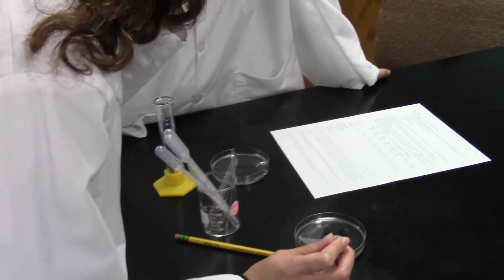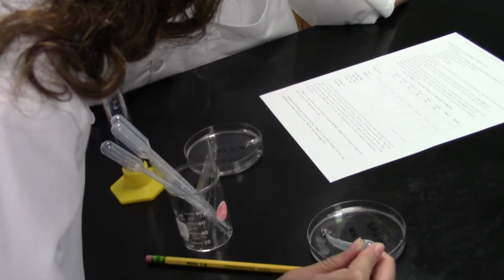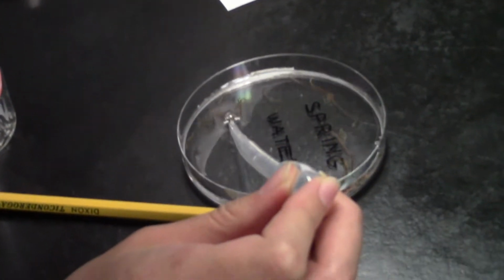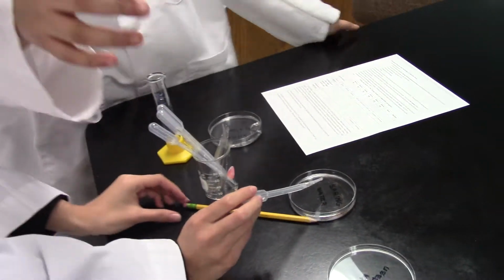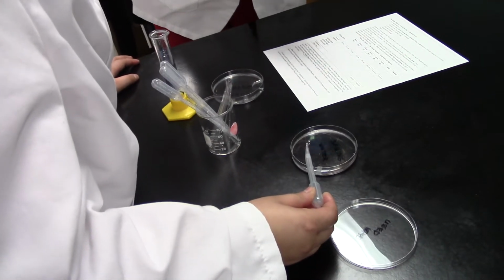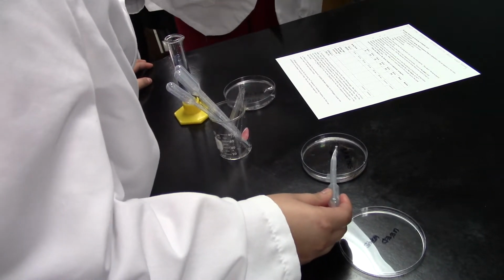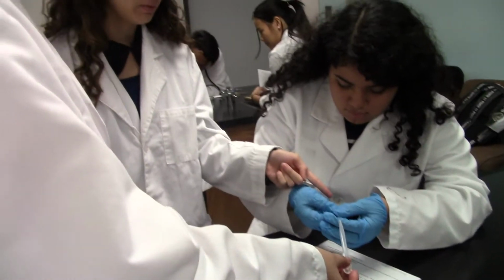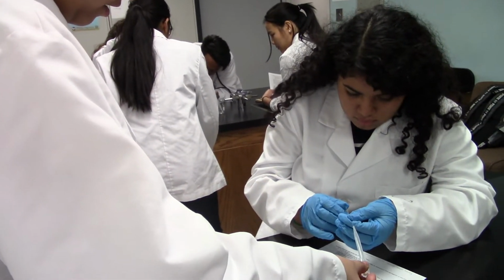So we had to scoop it up, right? Try the other end. Yeah, there you go. Oh my God, come back. It's hard, ain't it? Okay, so I'm trying to scoop it up, right? Squeeze the ball, and then suck him in, like let the ball up, and get right by the head of him. I can't do it. Yeah, and I have old eyes, so I ain't seeing it.